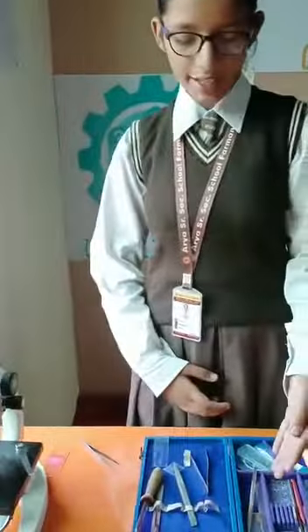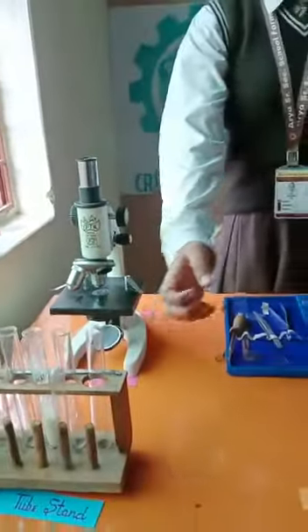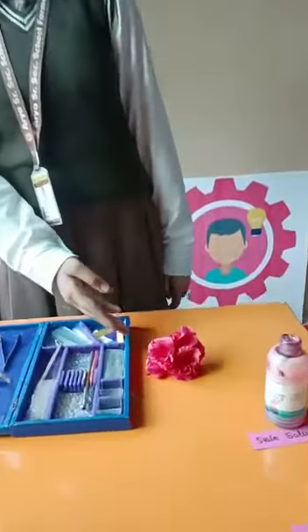Friends, to do this activity, we need glass slide, cover slip, microscope, test tube stand, distilled water, glycerin, stain solution and hibiscus flower.